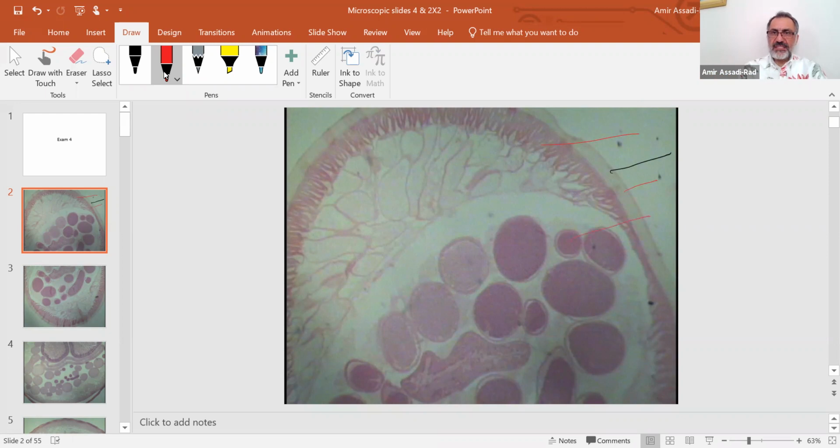And then that would be testes. So that's right there, the gut. And then, of course, these areas are pseudocoelom. Okay, all of that area, that's the intestine right here, as I mentioned. And then pseudocoelom area. Lateral line right here. And of course, this is a male. Do not worry about vas deferens, ejaculatory duct, and all of that. Just remember, all of these are testes.